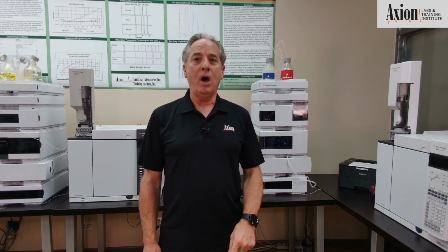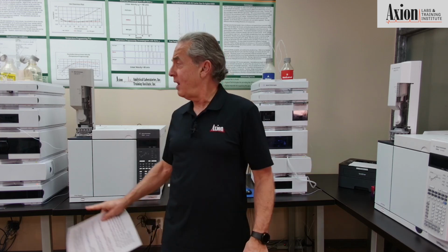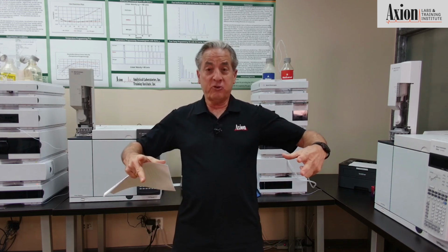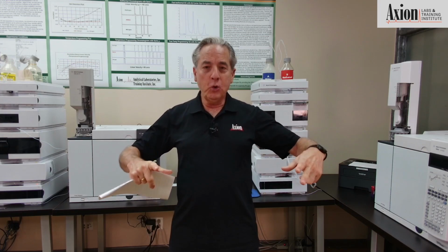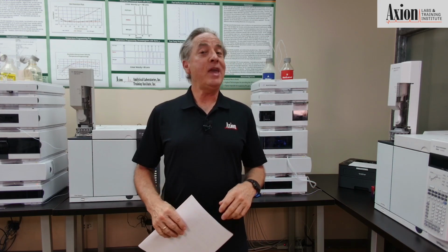So if you type in 1 and you do not have a side tray, then it'll say vial out of range. So the numbering in the Agilent world is if you have the side tray, and by the side tray, I'm sorry, I don't have one in my backdrop right now. I'm looking at one across the lab. It's the round side tray. It holds up to 100 vials. Those positions are labeled 1 to 100.